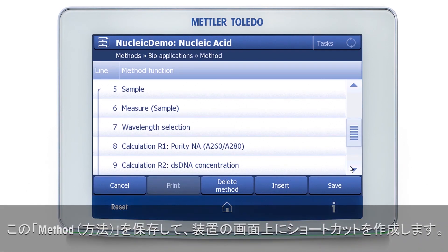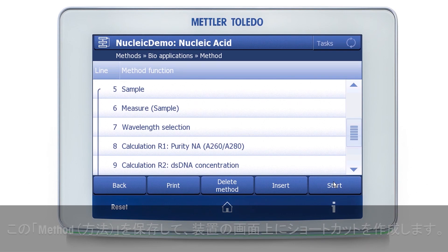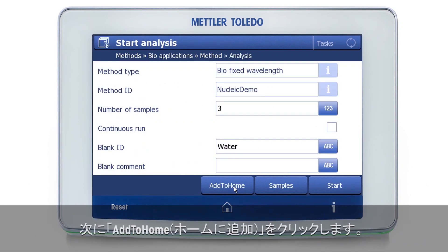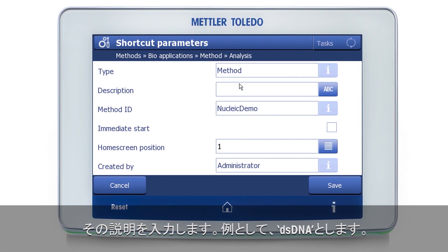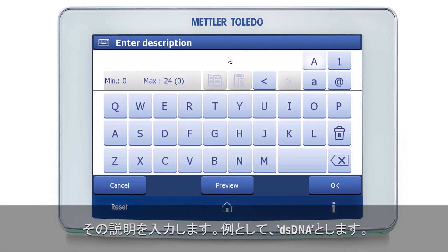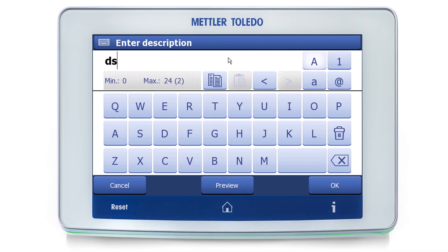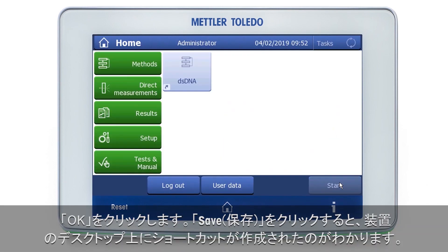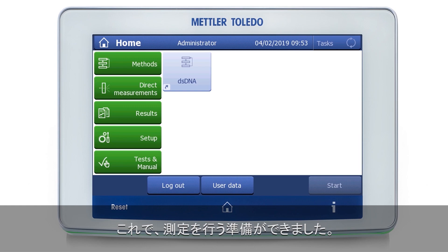I will now save my method. And now I will create a shortcut on the screen, which will allow me to start my method directly by clicking on a shortcut on the home screen of the instrument. I click on Start, then 'Add to Home', and enter a description — let's say 'dsDNA' as an example. This is then the label for my shortcut. I click OK, I click Save. And now you see a shortcut has been created on the desktop of the instrument, and we are ready to perform the measurement.